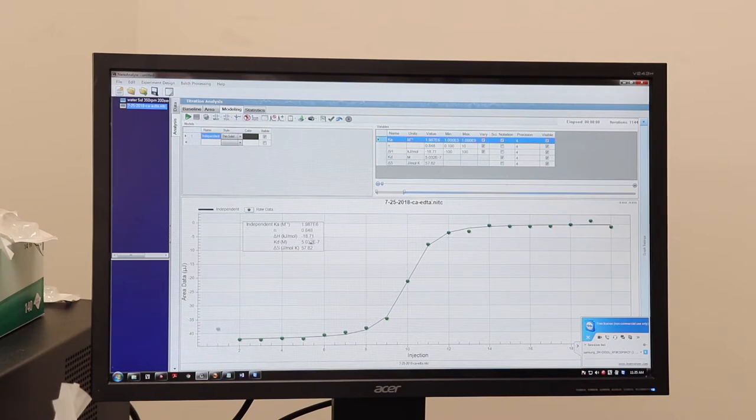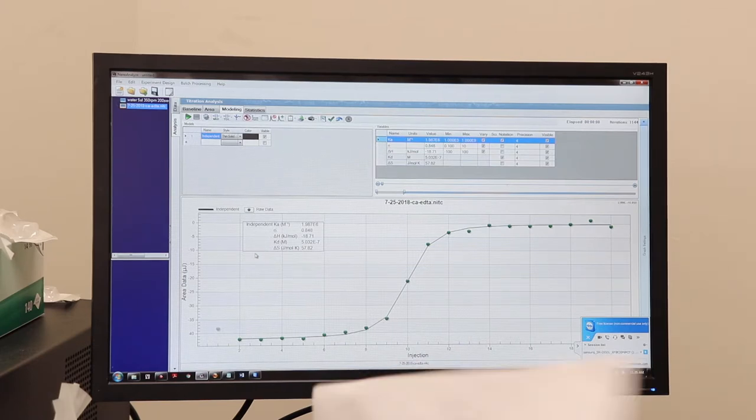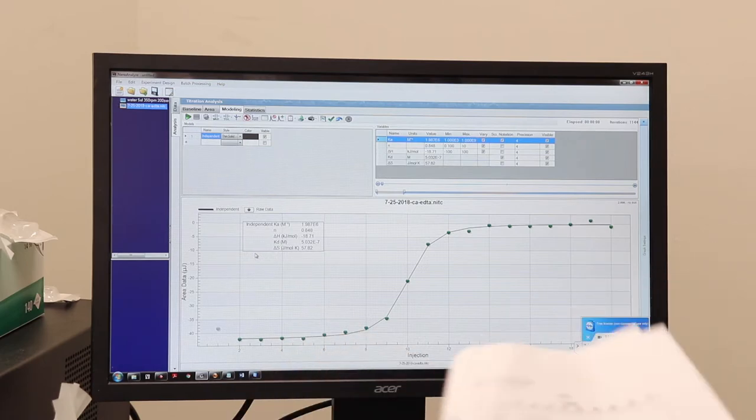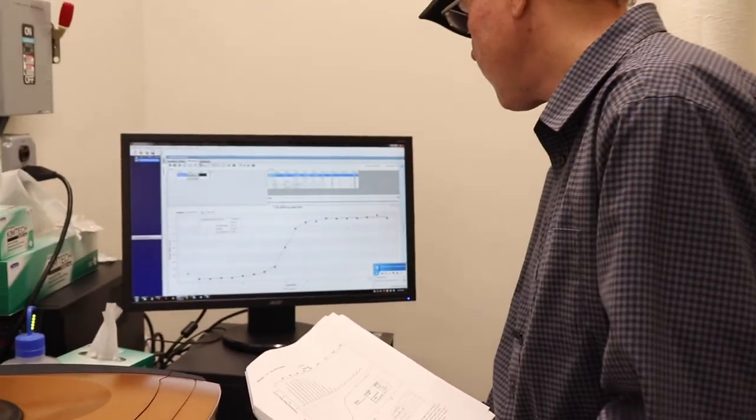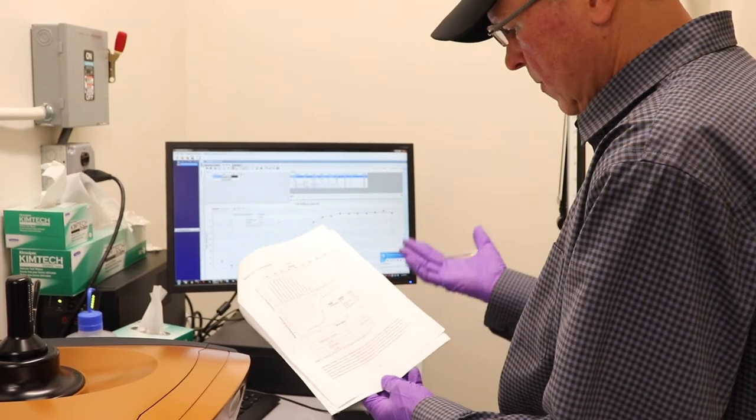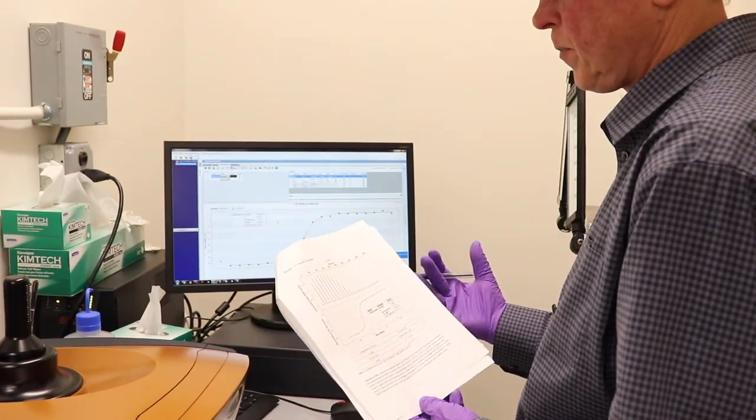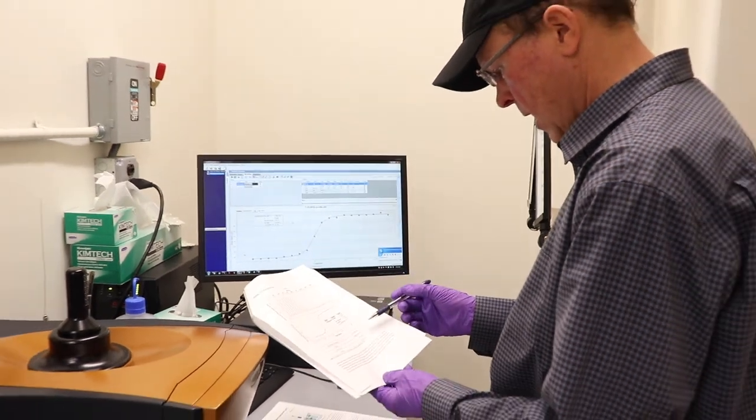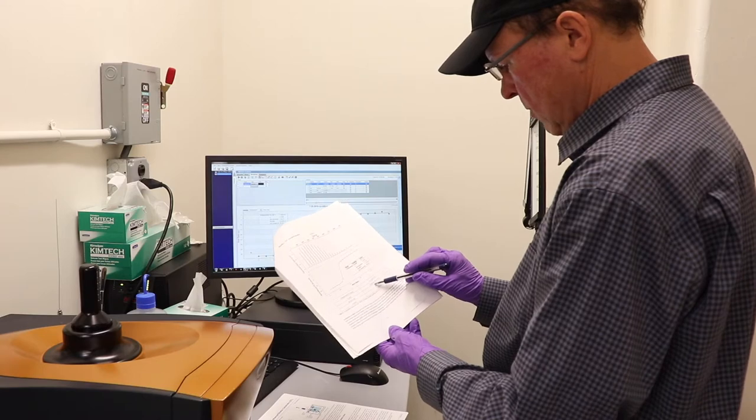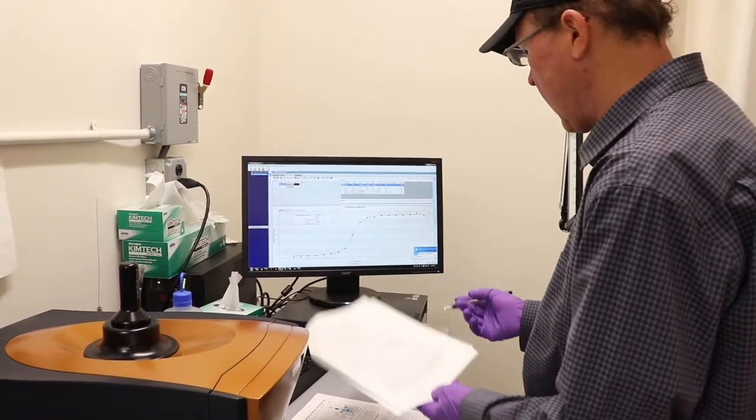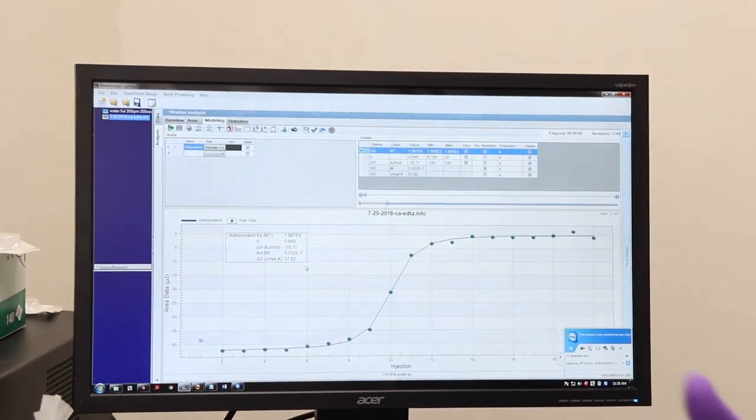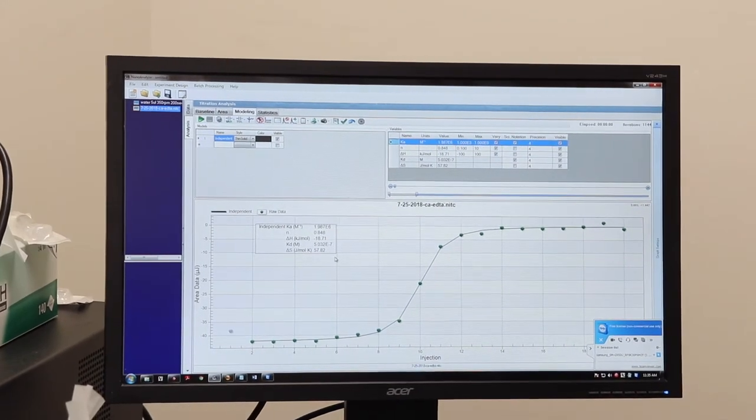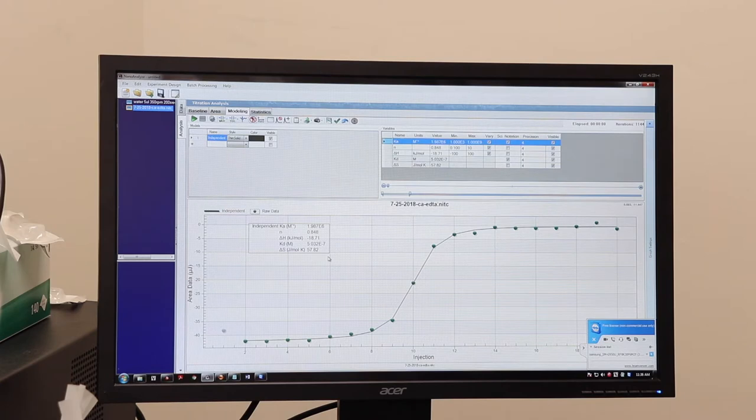So what you want to do is look at the KD, the N, and compare them to what they expect. So for N, you expect something, N to be equal to 1, 0.85. It's close enough. And it's up to you to decide how close you really want to get because this is a known experiment. And they give a KD you should get something between 3.9 and 8.99. And for this one, we're getting about 5 times 10 to the minus 7. So that's pretty good. At this point, I would feel confident in going ahead and doing some unknown experiments at that point. So that's the data analysis.